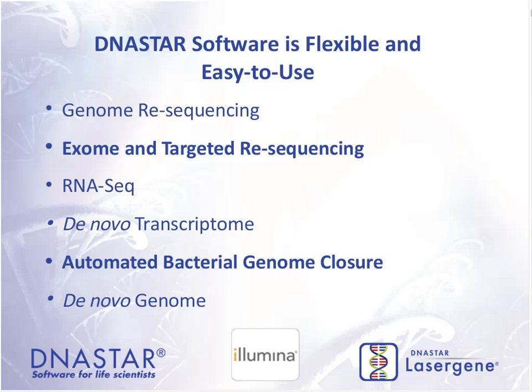There's also automated bacterial genome closure, and this is a novel workflow that DNAStar has developed recently, and it allows us to align our sequence data to the best possible reference genome, and then in an automated fashion identify the novel regions in the sequence strain and do a de novo synthesis in those novel regions. And of course, we can do this manually, or we can use DNAStar software and have an automated approach and algorithms that can do most of the work for you.